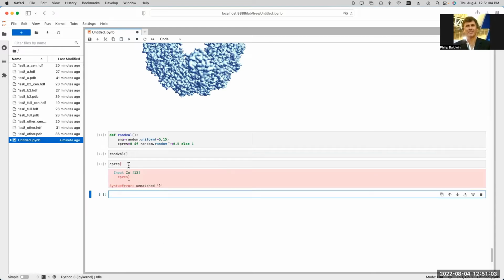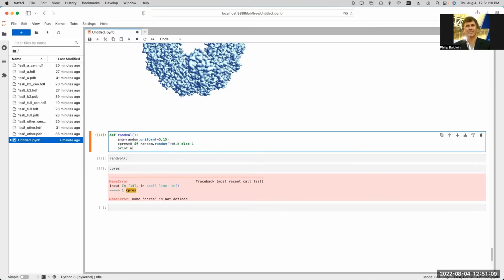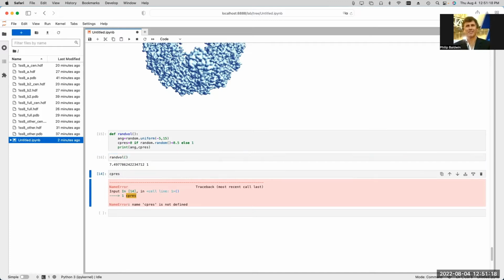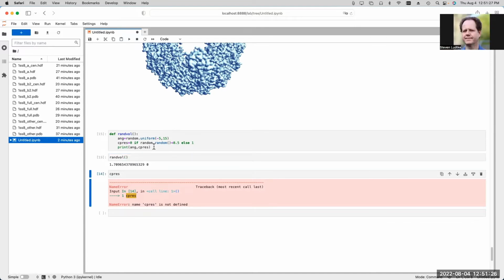Oops. Oh, it's only defined in there. What am I doing? We get a 0 at some point. There we go, 0. Okay, good.